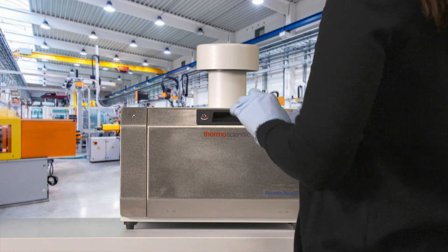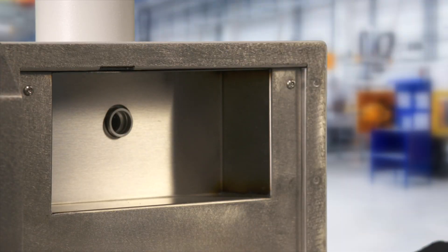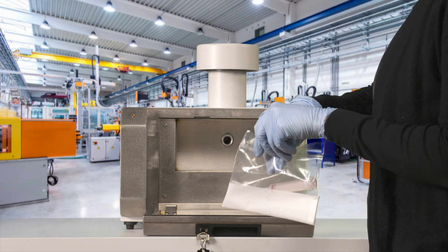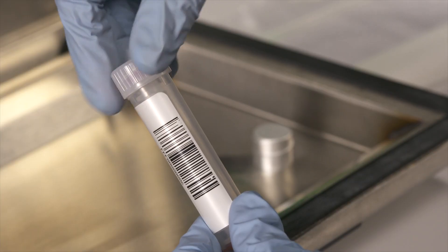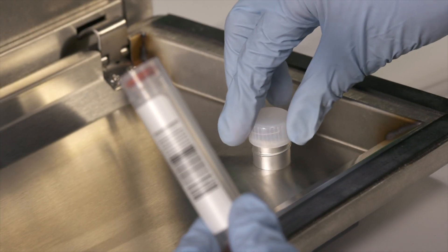To install, simply open the front door of the sampler with the included key. Unscrew the sample cartridge cap, and screw it onto the tray for storage.